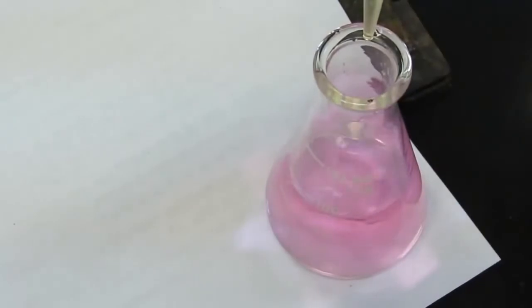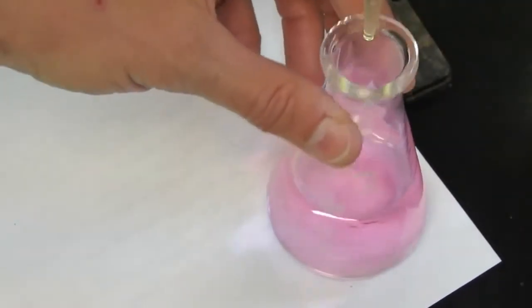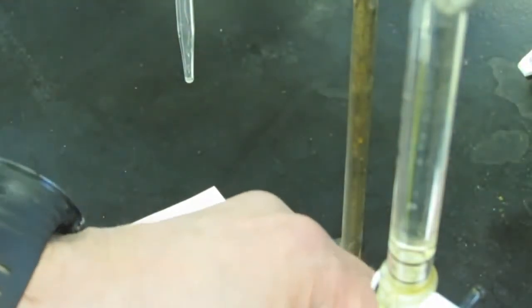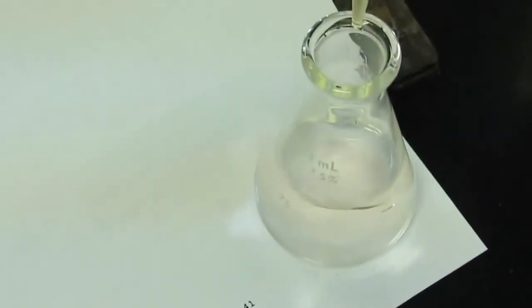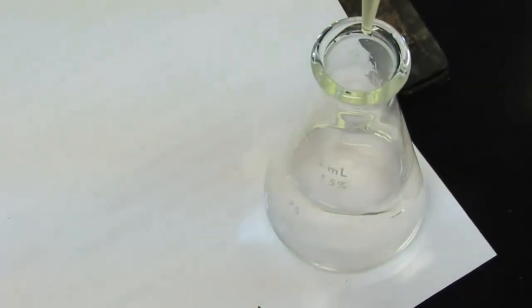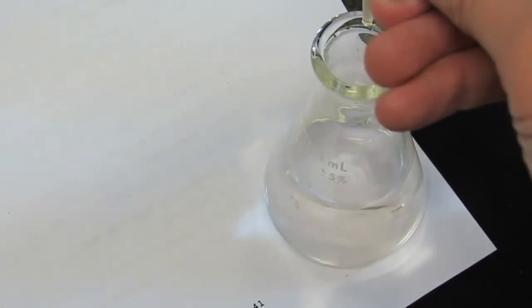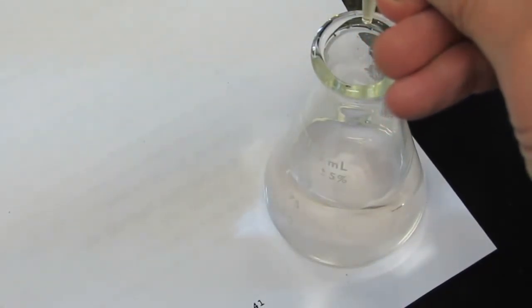And I'm not quite sure that's to the exact drop, so what I'm going to do is add just 1 drop of acid. Good hand-eye coordination is helpful here. There's 1 drop of acid, and you can see it's gone colorless again. So we will add just 1 drop of base, and then we will take our final reading. I hope I can get 1 drop here. If not, we'll have to add more acid again, won't we?